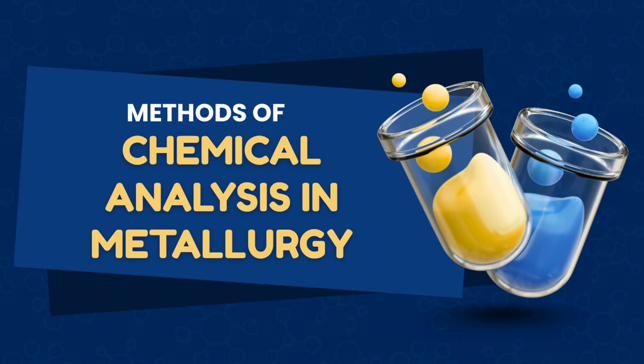Good day everyone. Welcome to this presentation on methods of chemical analysis in metallurgy. In this lesson, we will look at two major categories of analysis methods. The classical methods, which are the traditional chemical techniques developed many years ago, and the instrumental methods, which use modern machines and technology. Both approaches play an important role in determining the quality and composition of metals and ores.